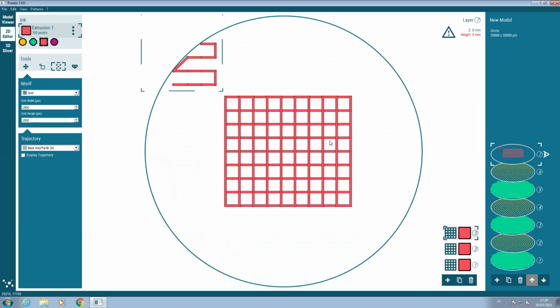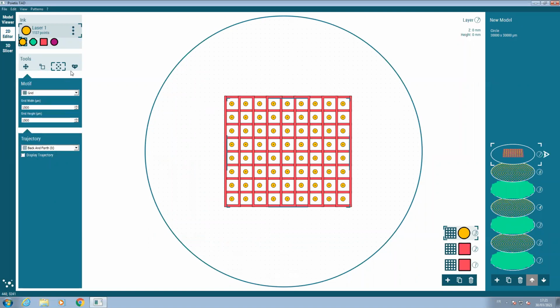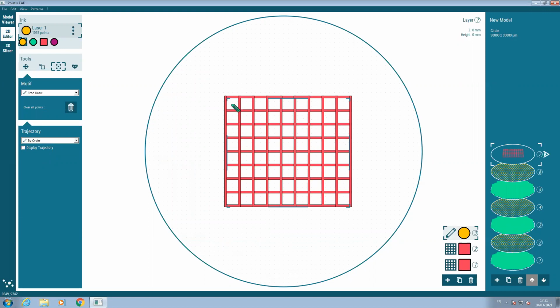So for this, I have to create patterns with the cells. I can resize it and do it like that. So it's really easy, or you can do like that, or of course you can do it again manually using this one with the free draw and say, okay, I want to print cells inside these micro wells, and you can design as you want. So I think that's all for me.